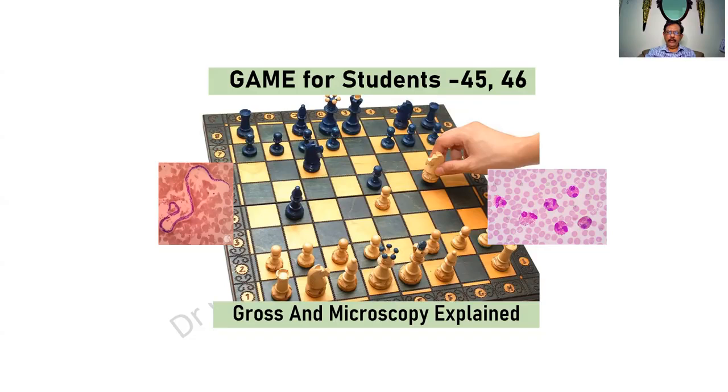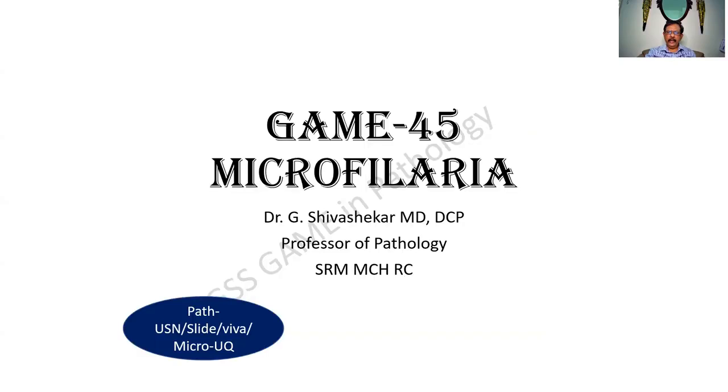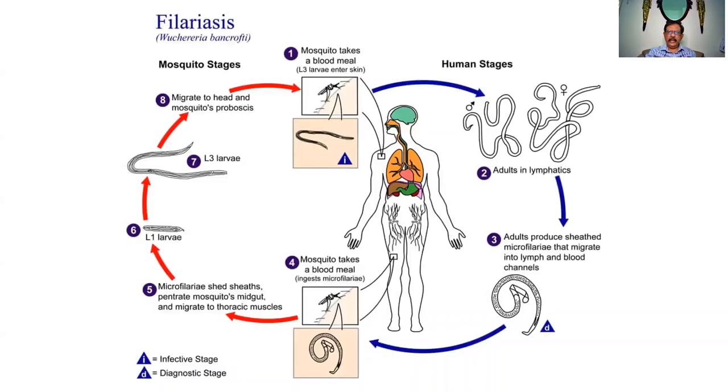In view of the shortage of time and the fast advancing university exams, I had chosen a couple of slides for the day, which are both intricately interrelated. The first is microfilaria, more in the domain of parasitology and microbiology rather than pathology. However, it is a very frequently asked question.